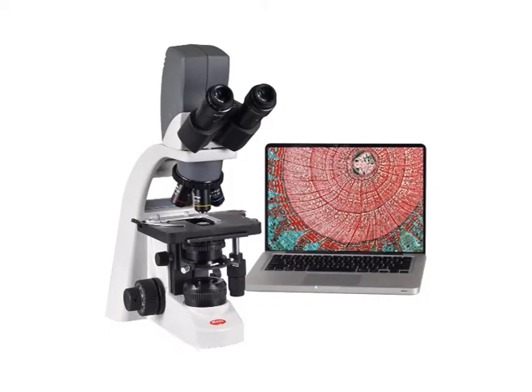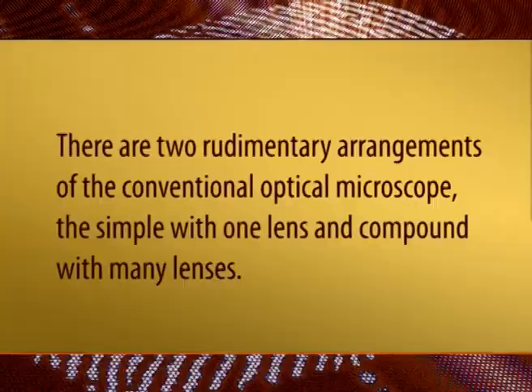Initially, images were taken by photographic film, but contemporary improvements in CMOS and later charge coupled device cameras permit the storing of digital images. Only digital microscopes are now accessible, in which a CCD camera is utilized to analyze a sample and the image is displayed directly on a computer screen devoid of the requirement for eyepieces. A substitute to optical microscopy which does not apply visible light comprises scanning electron microscopy and transmission electron microscopy.